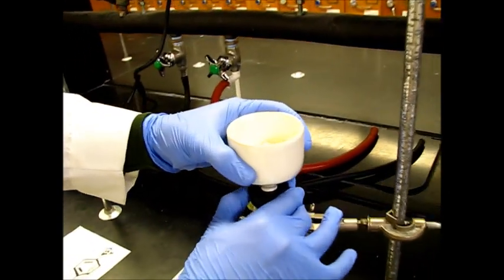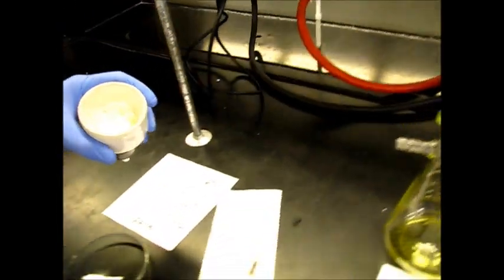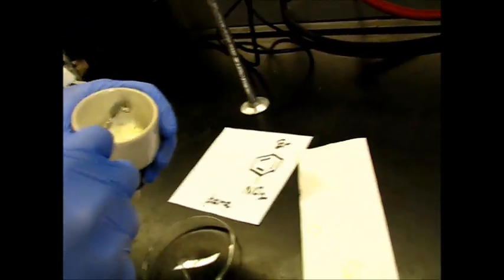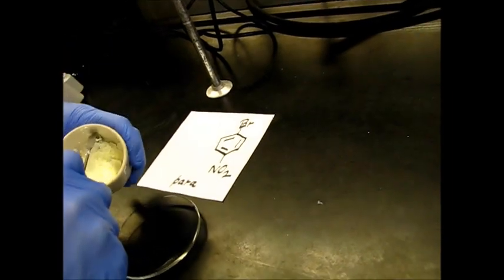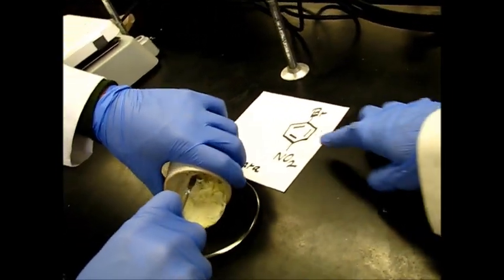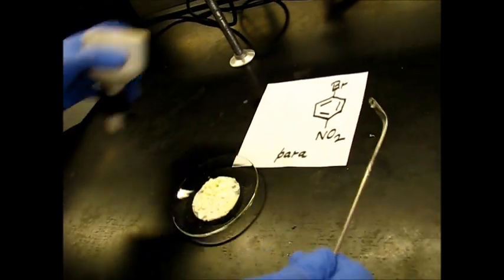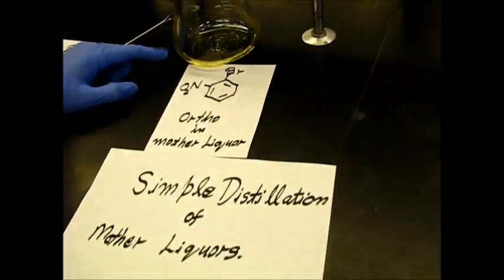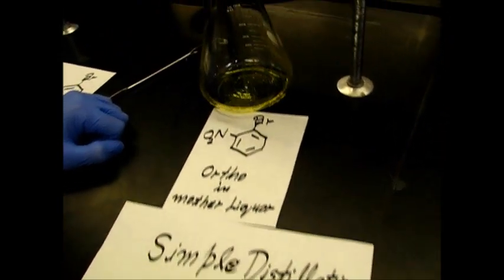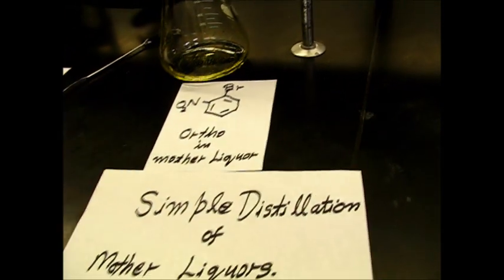Now that we've done our vacuum filtration, we're going to take the para product from the top and put it onto a watch glass. We're going to set this watch glass in the oven to make sure we get it completely dry and get all the ethanol out, so we can get an accurate mass. For our mother liquors — what came out of the vacuum filtration — we're going to put this in a simple distillation apparatus.